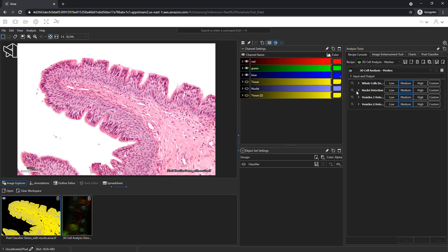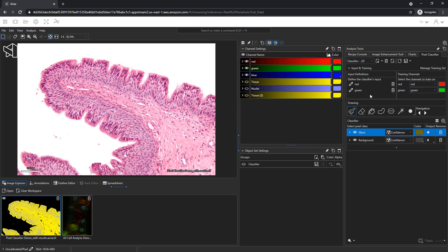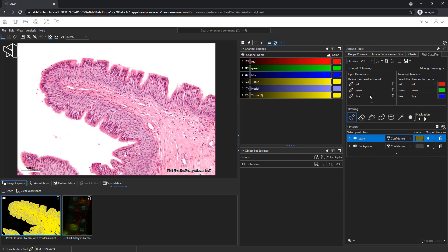The pixel classifier is in the Analysis Tools section. You can create a pixel classifier as soon as you open the image. We will include all three original channels as our input.